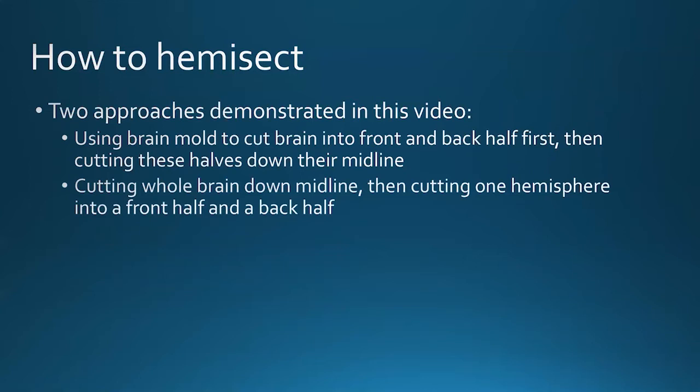Alternatively, we could cut the whole brain straight down the midline first, and then cut each of those hemispheres into a front half and back half to create a flat surface to mount on the vibratome chuck. Pros and cons briefly: the second approach still allows leaving an entire hemisphere fully intact without cutting front and back — useful if you ever want to see a whole neuron pathway from front to back of brain for 3D tissue clearing. The brain mold might give a little more precision in how we do the front-versus-back cut. It's up to you — there might be only very slight differences for most people.